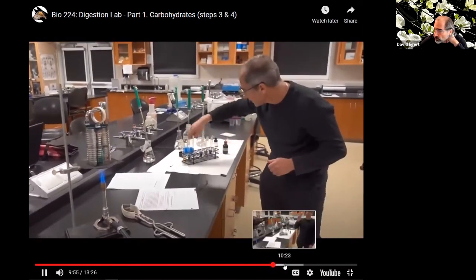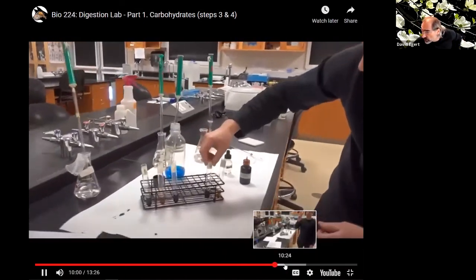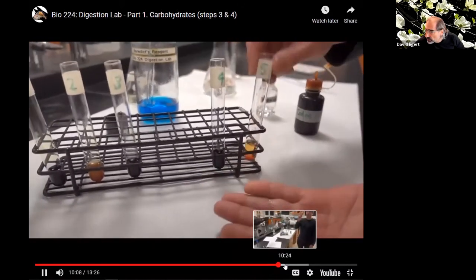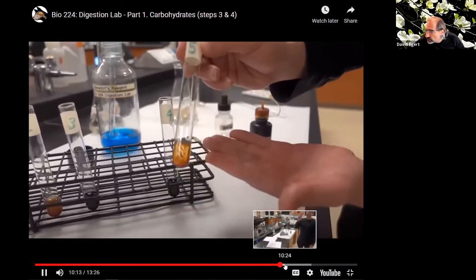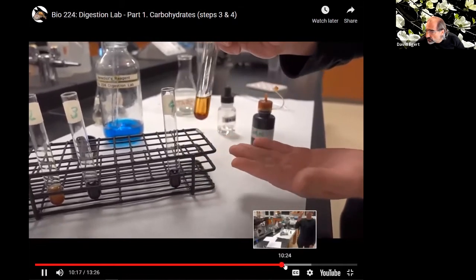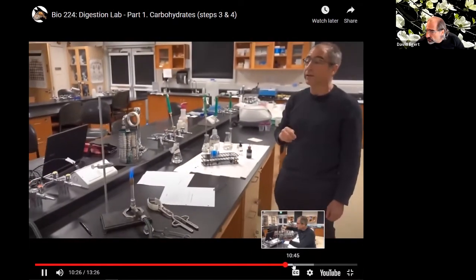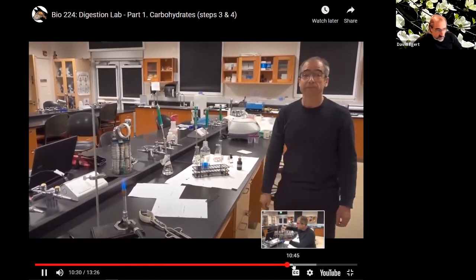So again, just to show you with the starch, pure starch is going to have this very strong reaction where you get this purple-black. And in the case of the maltose, where there was no starch present, you can see the iodine just stays this kind of amber color. So this was no starch at all. This is showing presence of starch. And we'll come back in a couple of minutes when the Benedict's solutions have had a chance to do this thing.